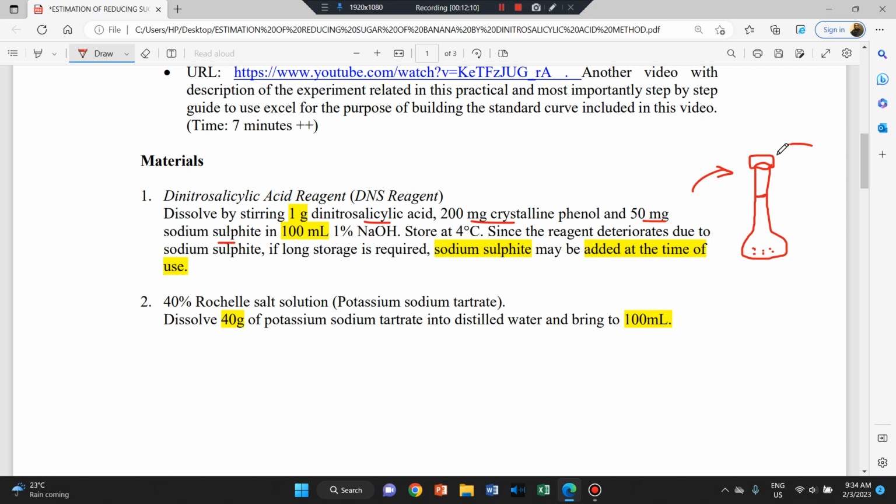And then you drop water, okay, until before the meniscus, because firstly you want to tilt it upside down until it's mixed thoroughly. Then you add further water until it is 100 ml exactly. So that's how you do the preparation of any solution that involves solid material.